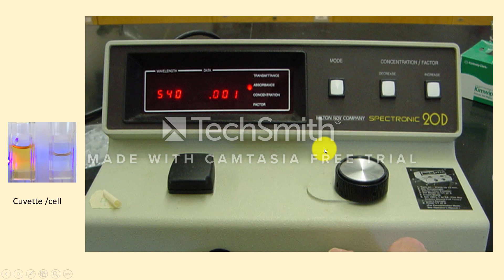This is a picture of spectrophotometer. So this is the knob of monochromator where you can select the required wavelength, and this is the absorbance display. This is the cell compartment where we can keep reference or experimental solution.